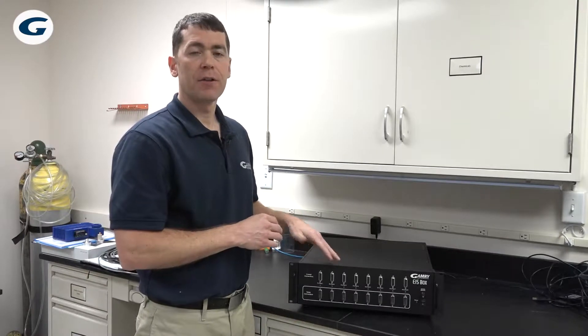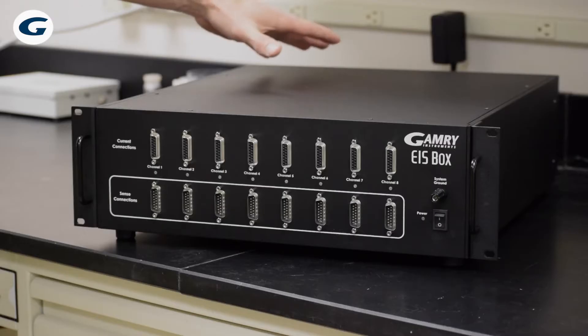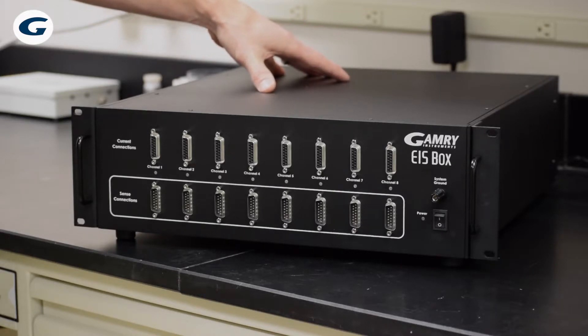It's ideal for small coin cells up to cylindrical cells and pouch cells. Its frequency range is 10 microhertz up to 100 kilohertz, and it will accurately measure impedances to less than a milli-ohm. Its communication is via Ethernet or USB.